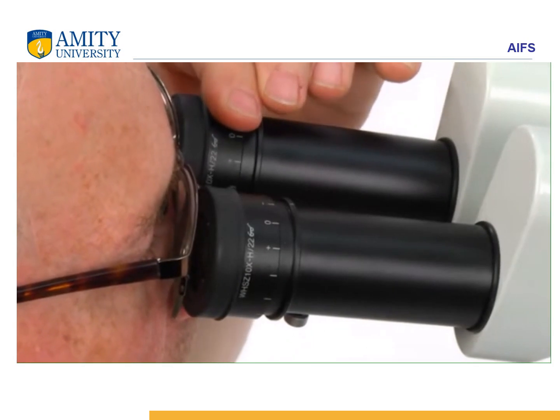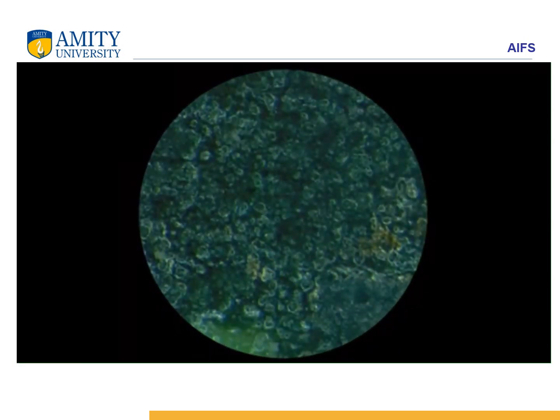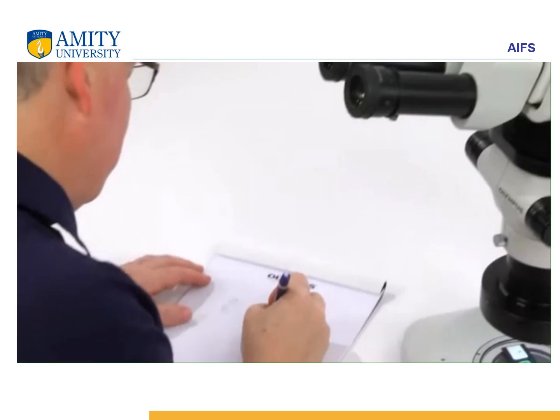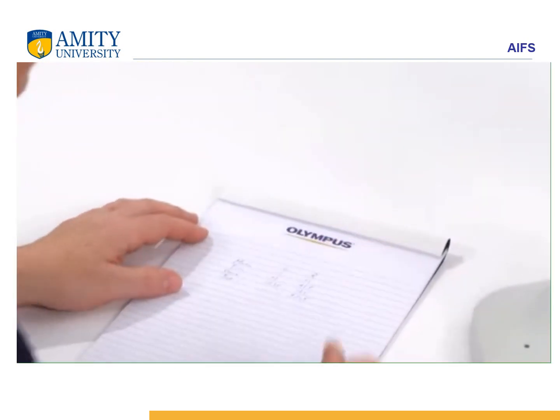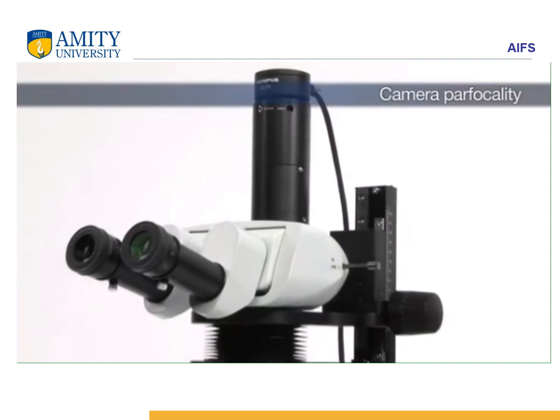So the person is now adjusting the diopter and is able to see the grain. The basic thing is to adjust it to 0, then you will increase the magnification.